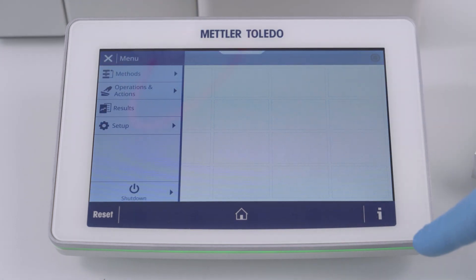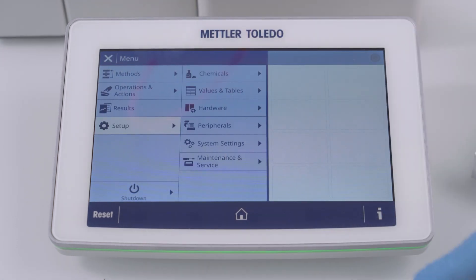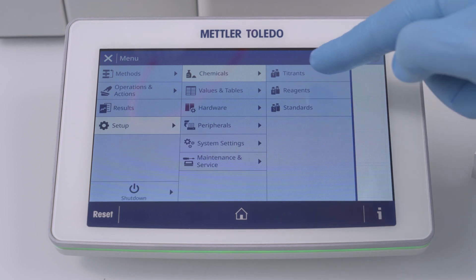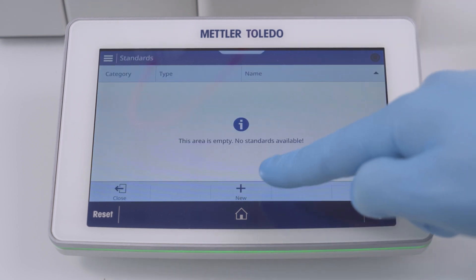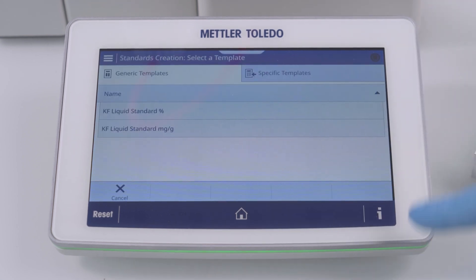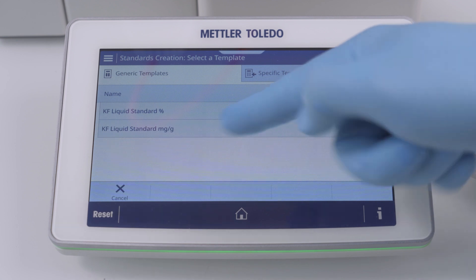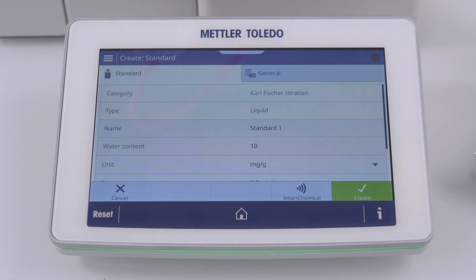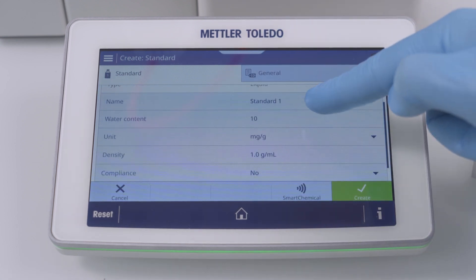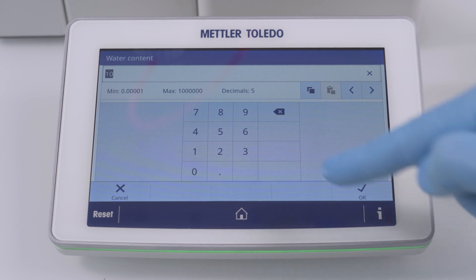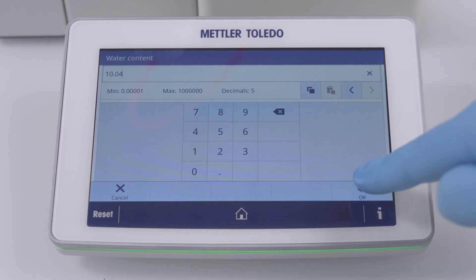To create the KF standard, open the main menu, choose setup, chemicals, standard and click on new standard. In this example, we define the standard value in milligram per gram. So let's choose this option. Then we adjust the standard concentration to the actual value written in the standard certificate and click on create to finish the standard setup.